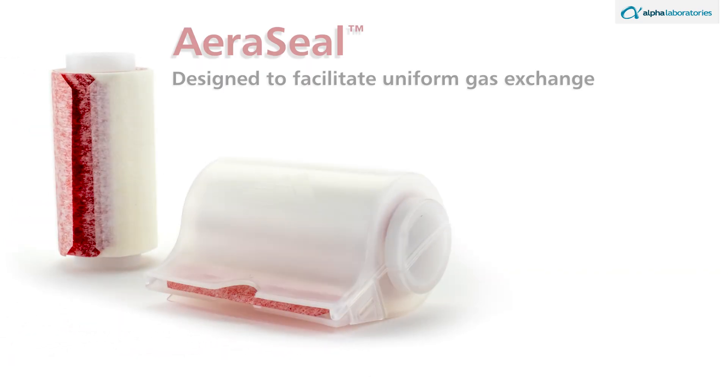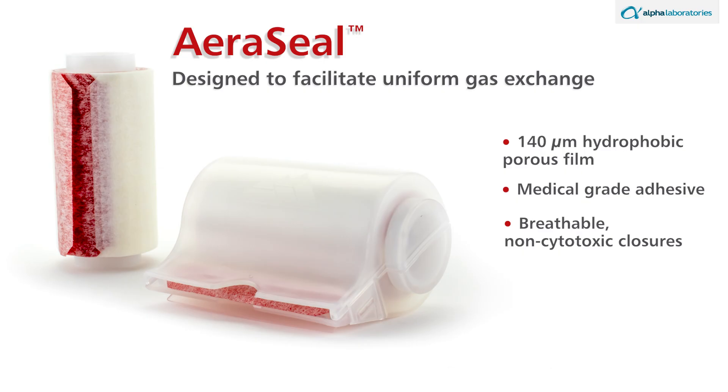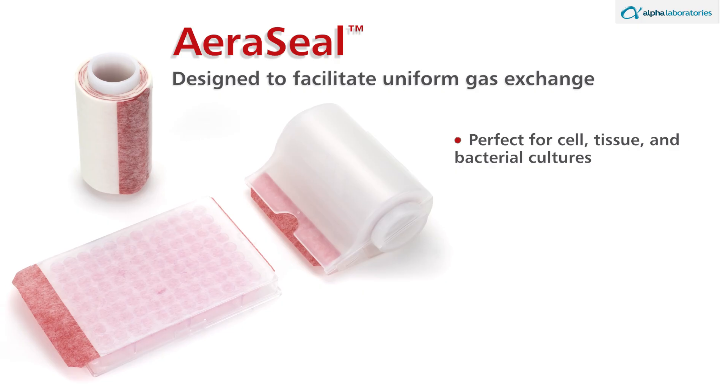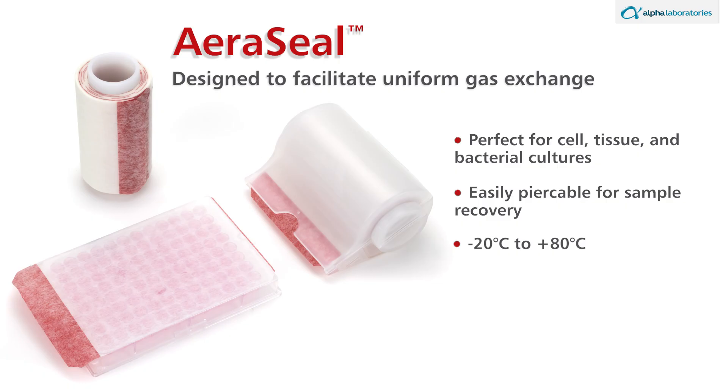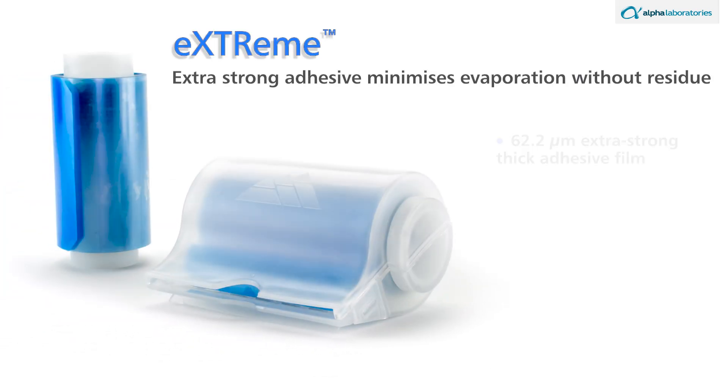Red coded Aero Seal 140-micrometer hydrophobic porous films with medical grade adhesive provide breathable, non-cytotoxic closures for tissue culture plates. Perfect for cell, tissue, and bacterial cultures, the film supports uniform gas exchange for cell or bacterial growth and is easily pierceable for sample recovery. The film is effective from minus 20 to 80 degrees Celsius, and each red coded roll covers 50 culture plates.